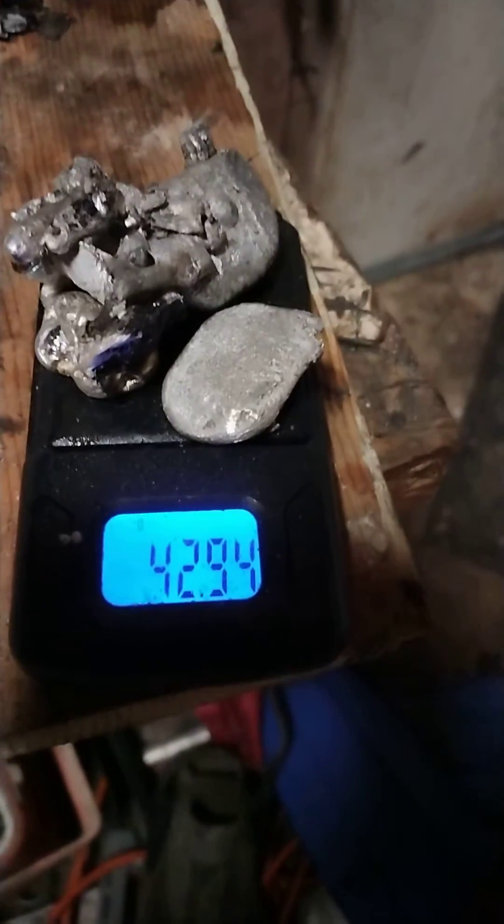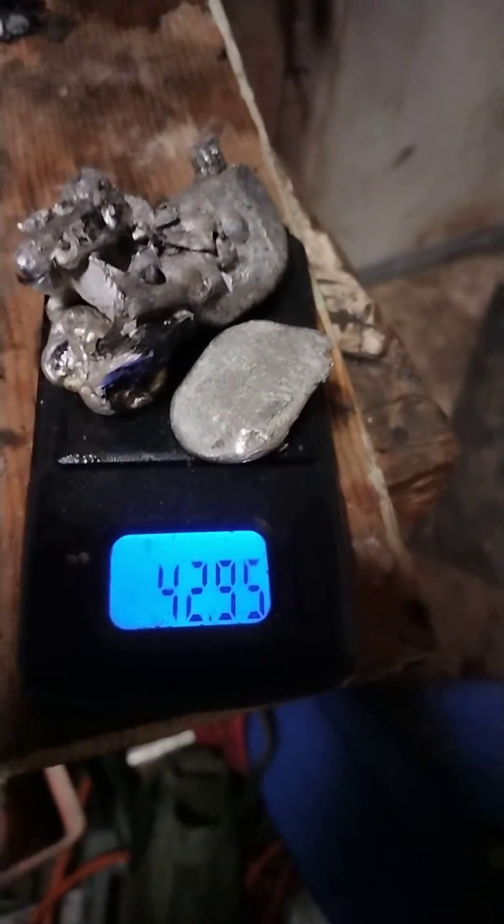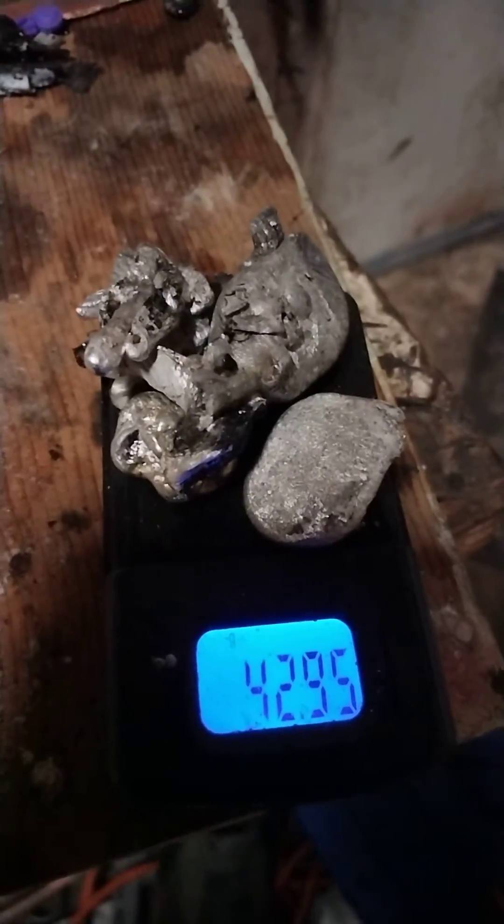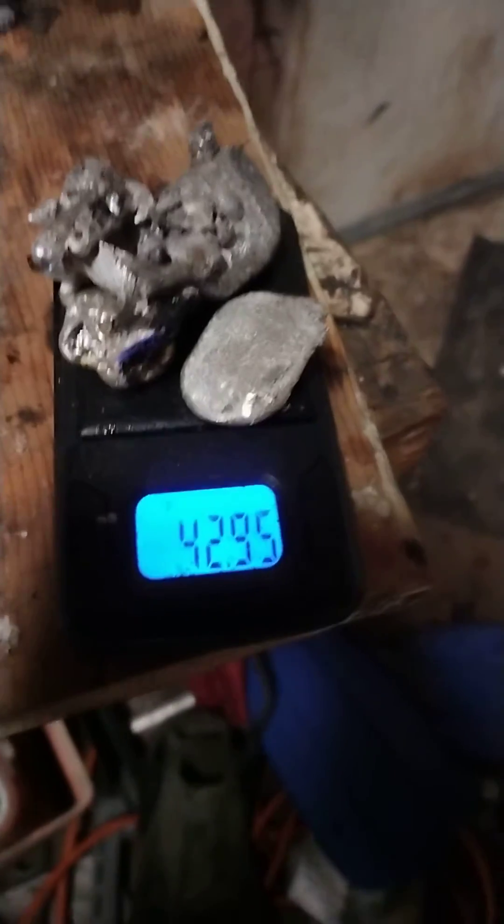I think there's just a little bit of platinum left that I've got to get out, but other than that, it's pure — that's absolute rhodium.